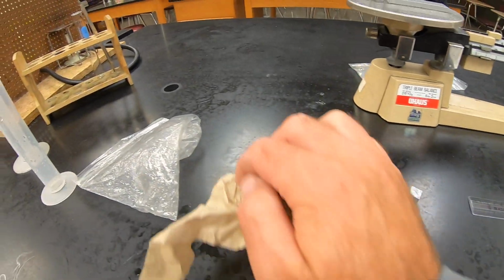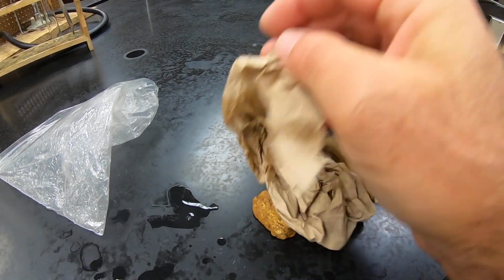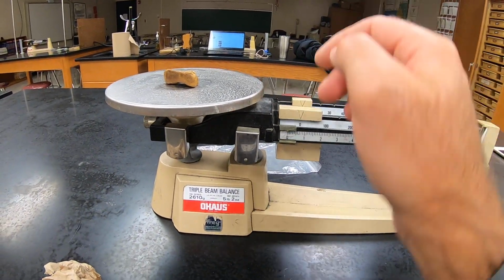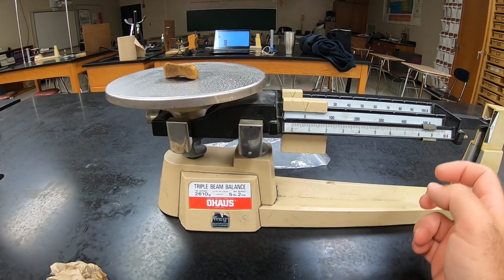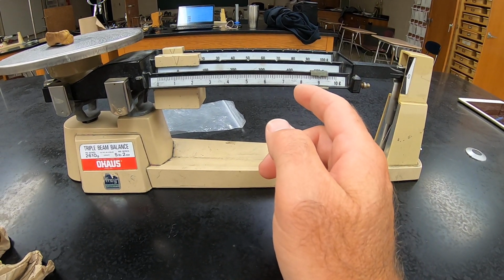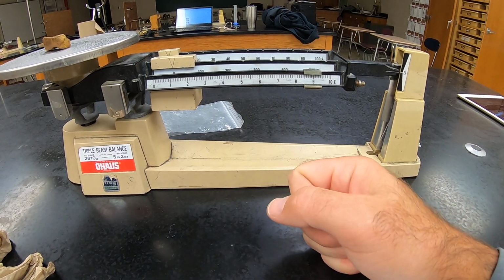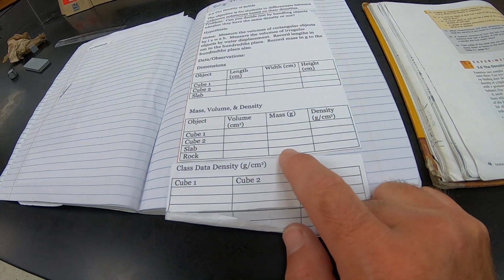And then we've got to do the rock too. The rock was in water. I probably should have found the mass first, but we'll dry it off real good. And then we'll put it on and see what we end up with for the mass of the rock. It's not quite 10. So it's 8.92. We'll put 8.92 for the mass of the rock.